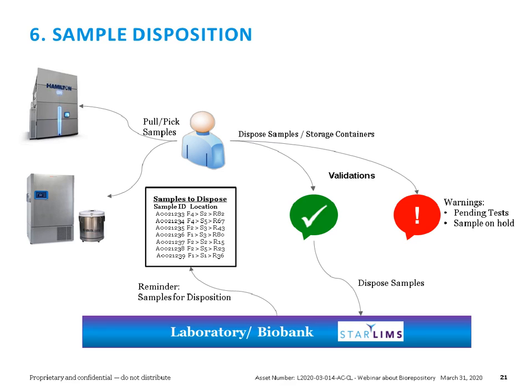Now, as the last example of a typical biological workflow, I'm going to talk about the sample disposition. Sample disposition is something that at some point is going to be needed, and it could be triggered by different events. Perhaps there is an expiration date to your samples that could be driven by the retention time, or it's just the stability of the sample that dictates that expiration date.